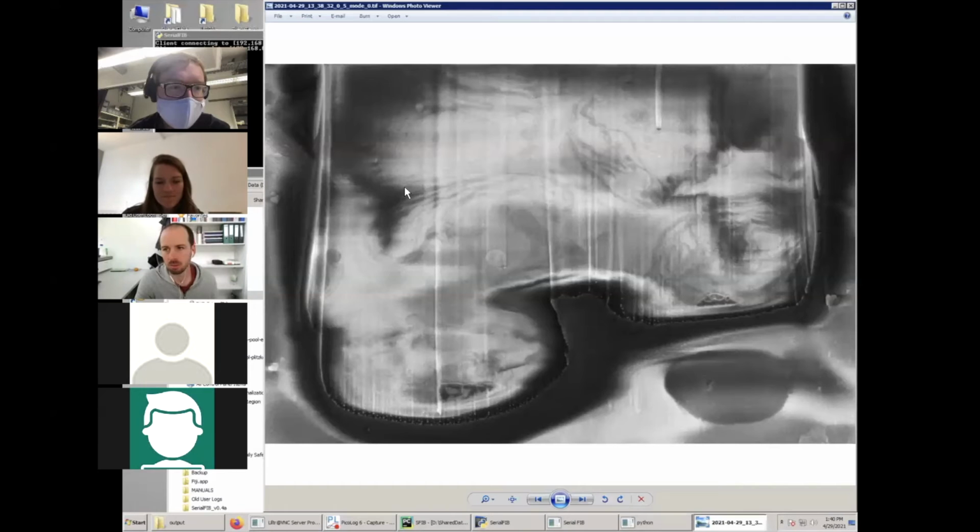But right now you're also milling with current 1 nanoampere. Is that okay for afterwards too? I guess then anyway you mill deeper to produce the lamella again. Yeah. So I mean, maybe the other people can also comment, but at least in my experience, 0.5 nanoamp to 1 nanoamp, if you remove something like 200-300 nanometers of the top afterwards, even less, I guess, would still be okay. Thank you. Any additions, Sarah, or you agree with me on that point?